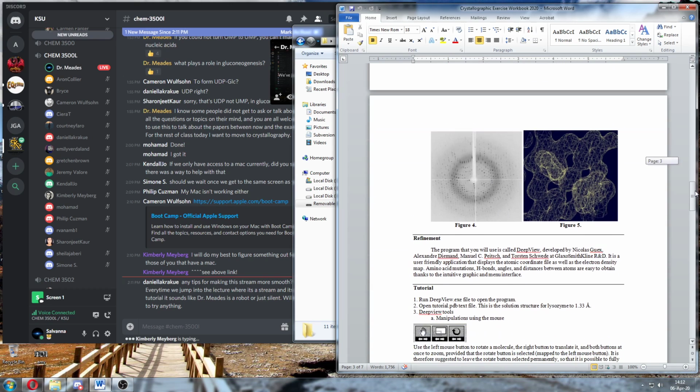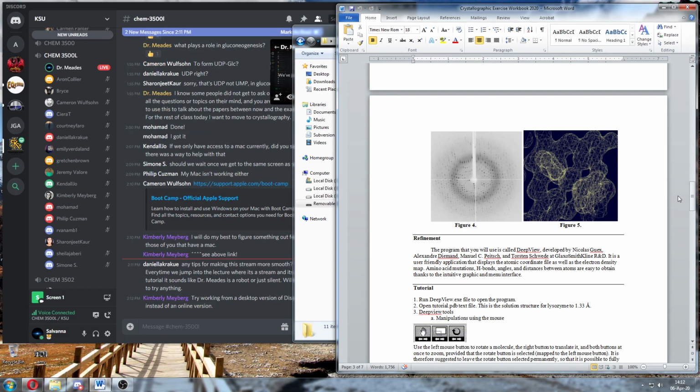And then of course figures 4 and 5 are here if we can pretend to take these crystals to an X-ray source, a synchrotron source. I could fly you all to Switzerland and do that if I had an unlimited budget, but we don't have that. Or you can send them right off campus as we did at LSU. And you can take images with an X-ray beam.